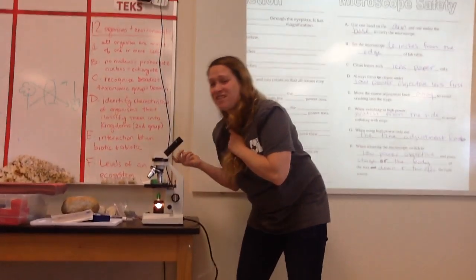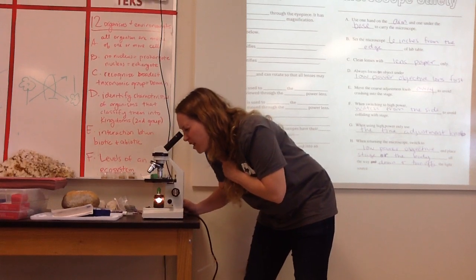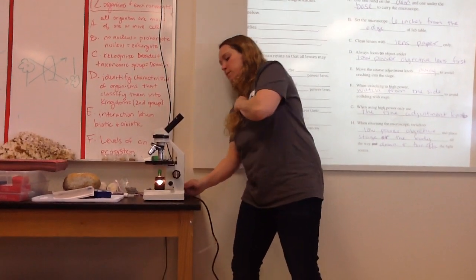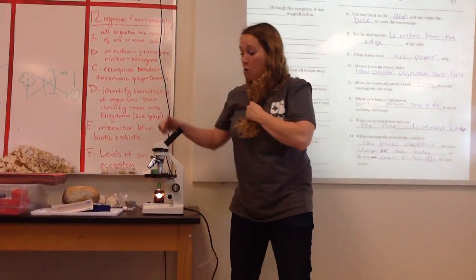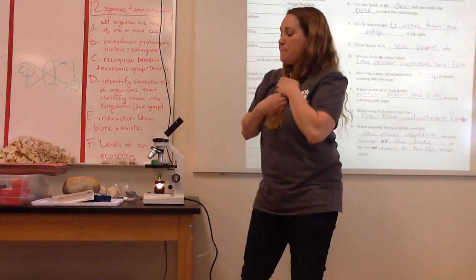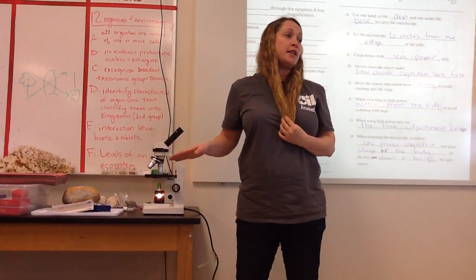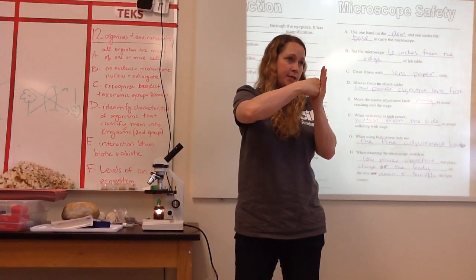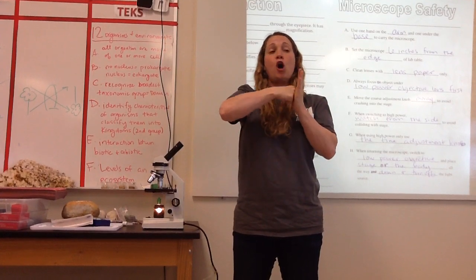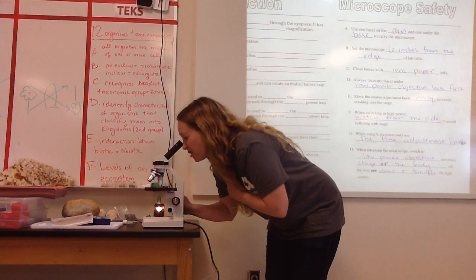Oh, I passed the spot where it's in focus. Can I just put my eye on and go forward again? No. I have to take my eye off, look from the side, raise it all the way up. When you're on the high focus lens, it gets so close it can touch. So this is when it's really important to make sure you're not slamming it. One slam, it's hard metal. It'll break the slide, okay? So then I just back up till it comes into focus.